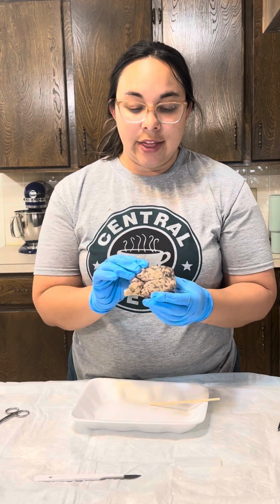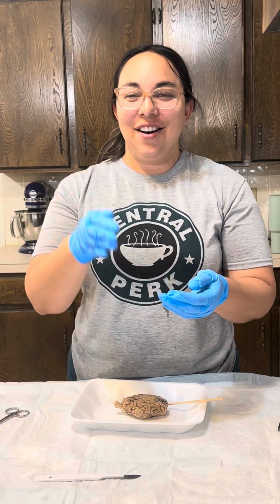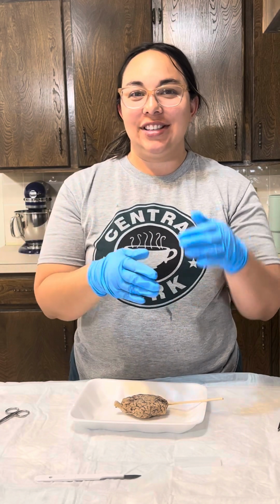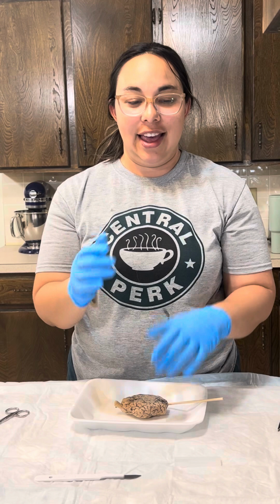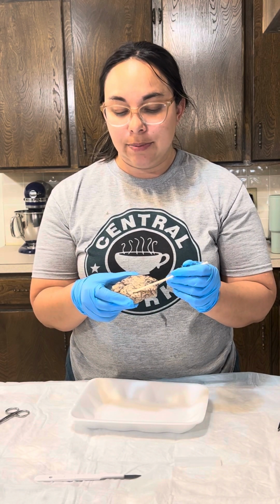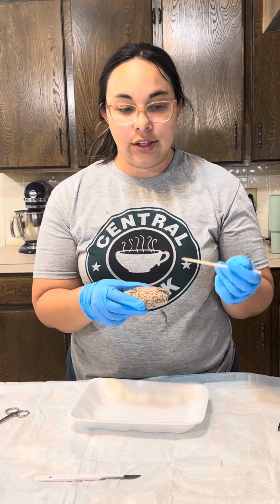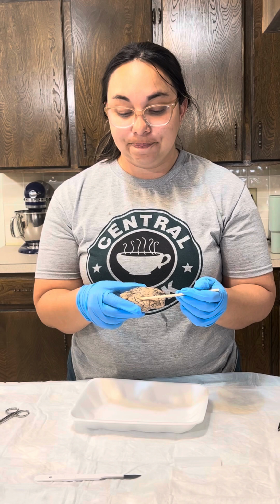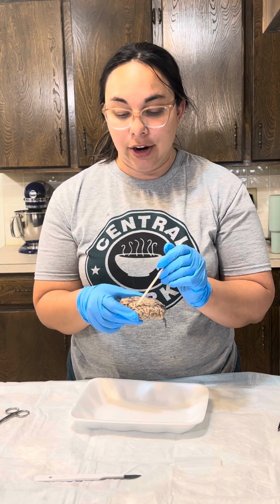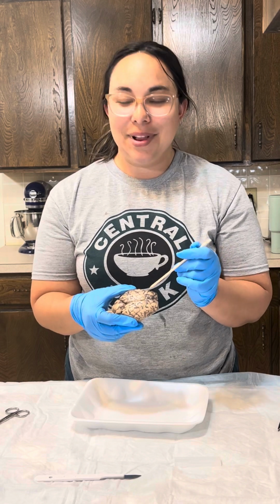This one's kind of flat and you can't see it here, but on a plump brain, there are dips and ridges and valleys to your brain, and they have names. All the white parts are supposed to be a little bit raised, and those are the ridges, and they're called gyri.